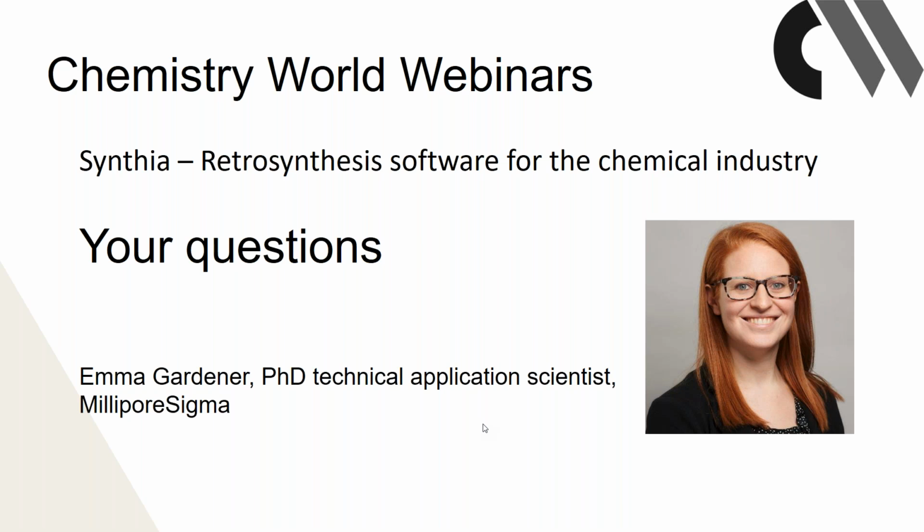And if I'll just maybe expand on that a little bit, as I mentioned with having an R group, we do actually have a batch mode. So you can't necessarily specify one group that's different, but you can upload a whole list of molecules to set up a search at once. So if there were a few different positions that you were substituting somewhere, you could do something like that. So although you can't fully wildcard, you don't have to just go through and do everything manually one at a time. You do have some time-saving steps in there. Right.